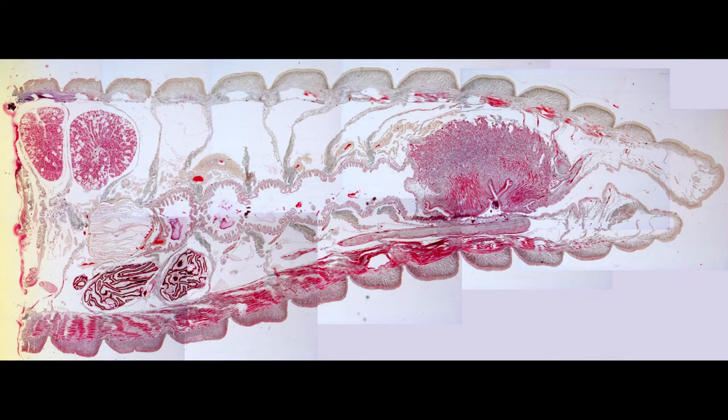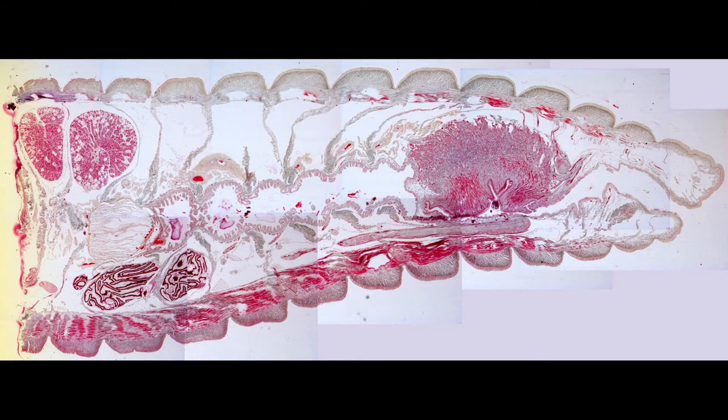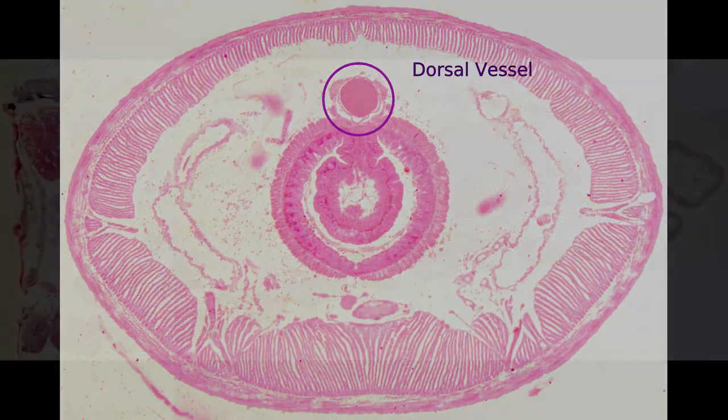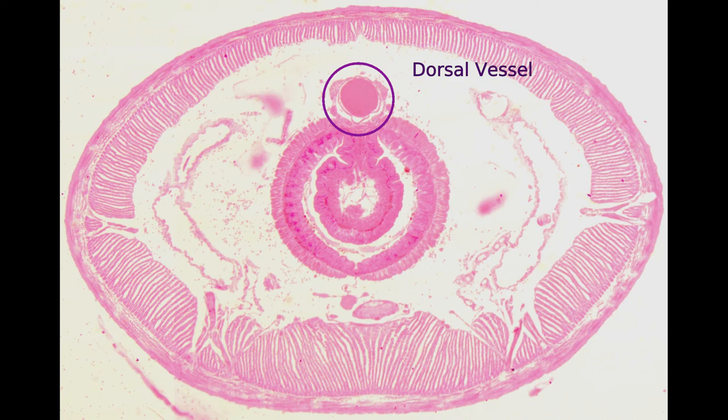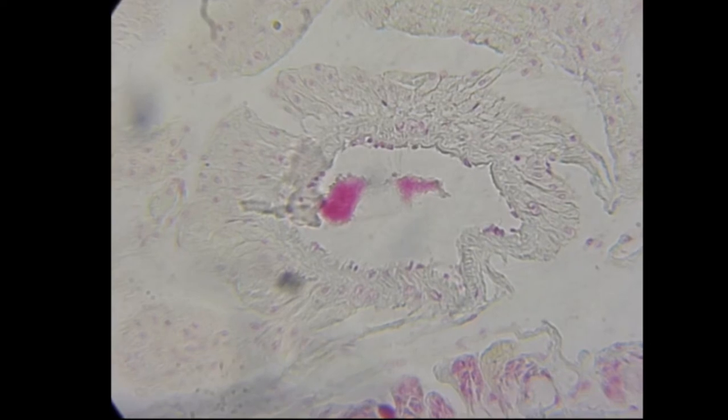Above the esophagus we can appreciate some remnants of the worm's pseudo-hearts. They're not very clear on this section but they're worth mentioning. Unlike us, earthworms don't have a single muscular heart that pumps their blood in a single direction. Instead, the dorsal vessel which we could see on the transverse section is contractile and pulses at a rate of about 11 pulses per minute. This keeps the blood moving along the vessel and also around the rest of the circulatory system. The dorsal vessel is attached to the ventral vessel in all body segments by paired commissural vessels which run in the peripheral coelom and body wall. In five segments these commissural vessels are enlarged and contractile. These are the pseudo-hearts, which also contain valves to maintain unidirectional flow. The cells that make up these contractile blood vessels don't look very specialized, and there's no specialized conductive tissue as there is in more developed hearts.